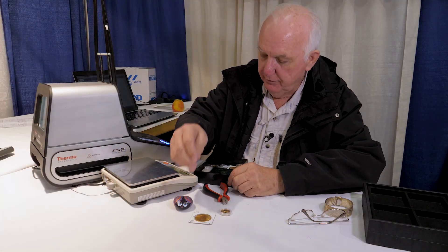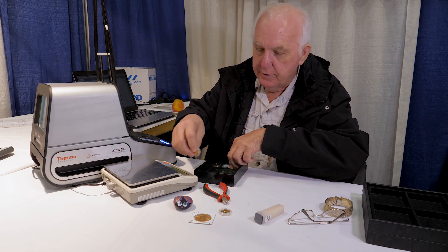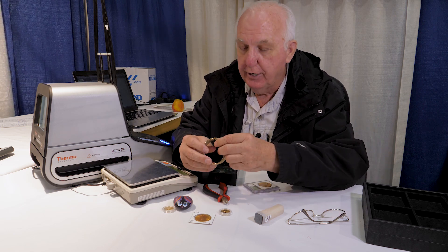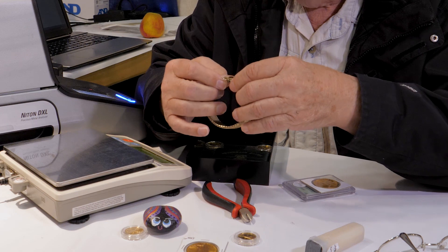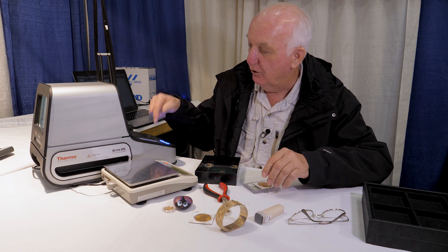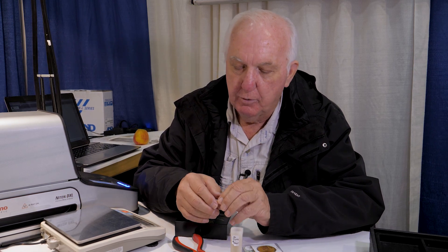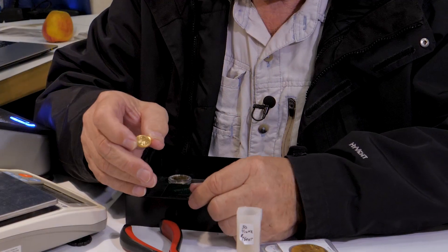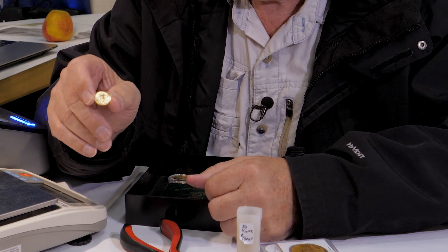Today we have some gold coins here that we'll test and show you. This is a one-tenth ounce gold eagle, fine gold — minted by the United States government. A lot of people use them for jewelry: earrings, necklaces, put them on rings. A lot of people also buy them as an investment, getting away from fiat currency. It's a good insurance policy against inflation.